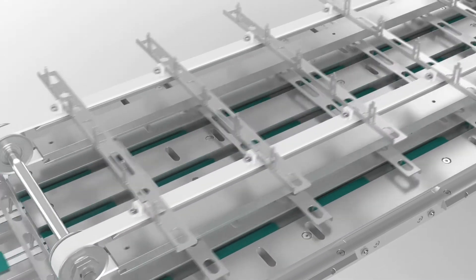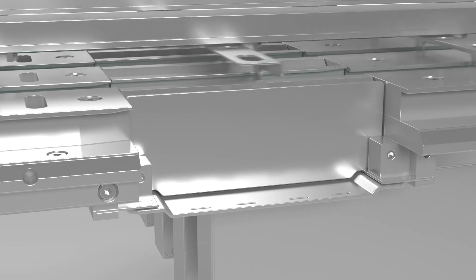For stick packs, a multi-lane pushover system is the preferred solution.